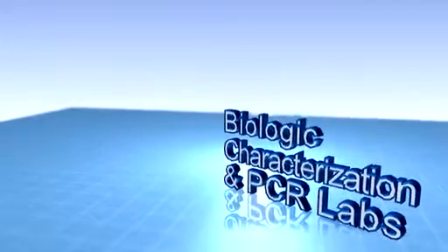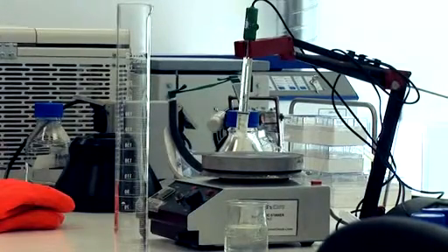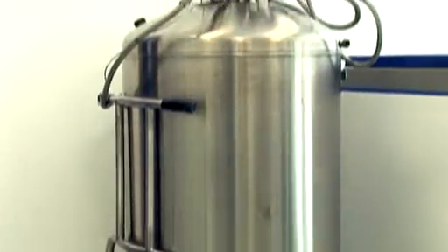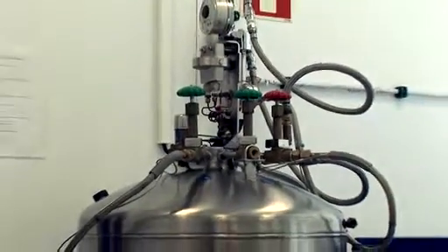The biologic characterization and PCR laboratories are equipped with a microplate reader, 2 cryopreservation tanks, horizontal and vertical electrophoresis tanks, transilluminator, UVP, together with other small equipment. This equipment allows the characterization of the cultured cells. Additionally, this laboratory supports the cell culture laboratory for reagent preparation.